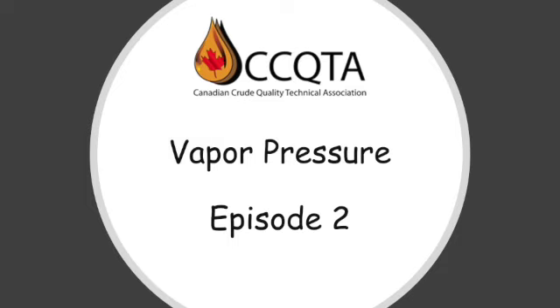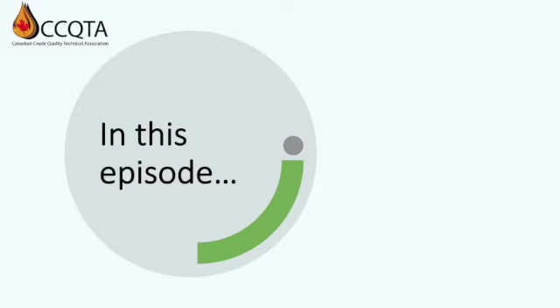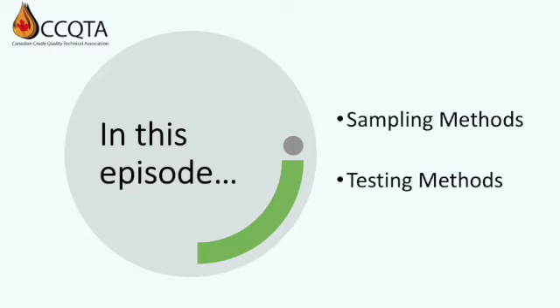This is our second episode on vapor pressure, with a focus on sampling and the impact sampling may have on vapor pressure measurement. In this episode, we're going to focus on two areas: sampling methods and testing methods. Now, before we get into these, let's roll back to a couple of items we talked about in episode 1 that impact both of these.